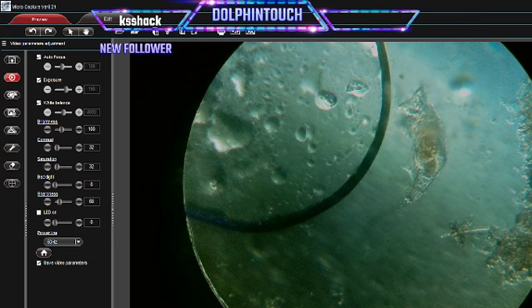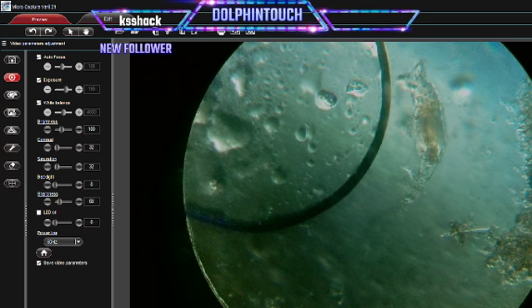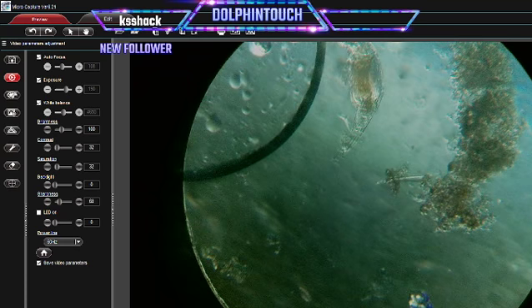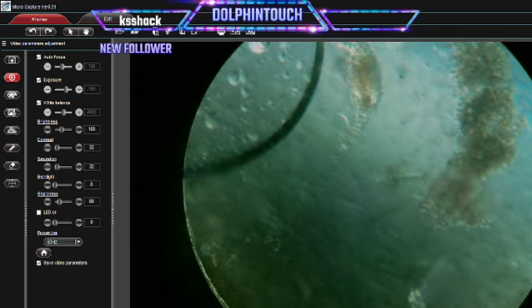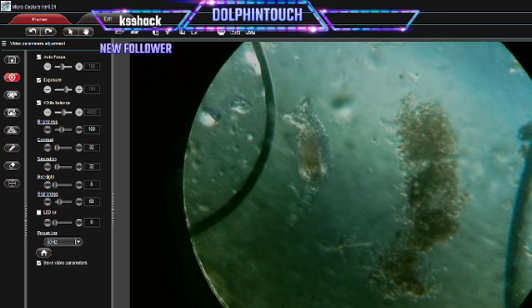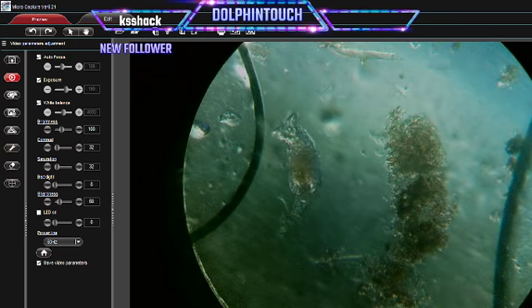Okay, now I think I've got this right. And here is what I have found in some water in my greenhouse. So we can go have a look, if I don't lose all the cool creatures. Now, at first I thought this was a tardigrade, but it's not.